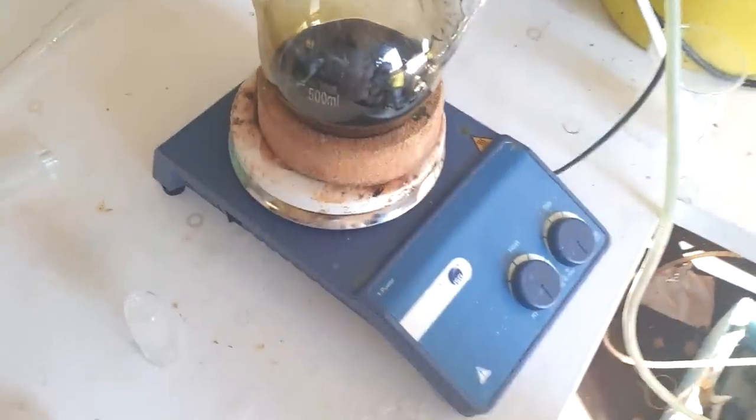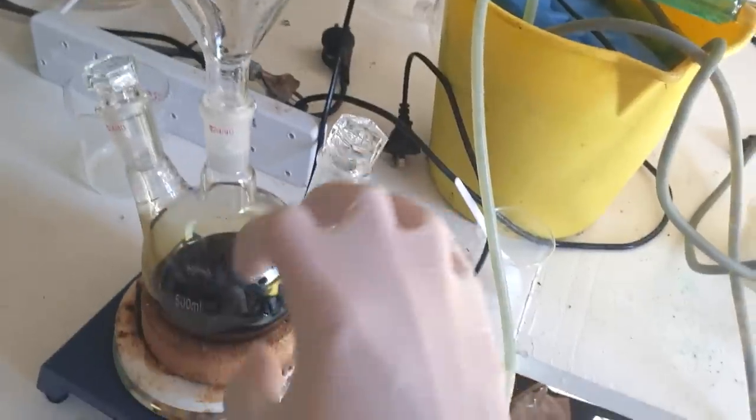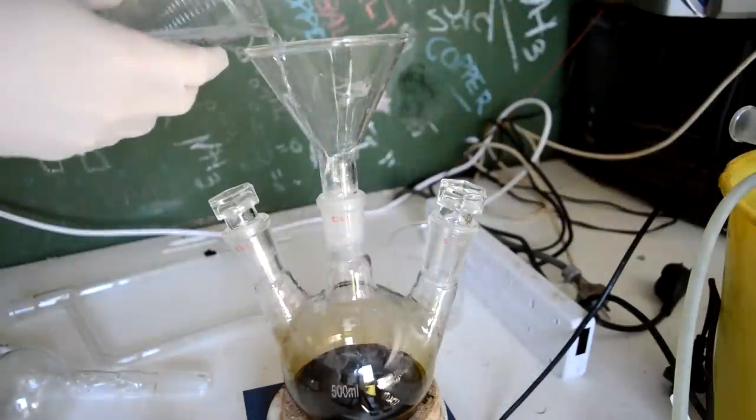We should be expecting that because there's no water in here at all. We've driven all the water out with the Dean Stark. You can see that that solid is down the bottom. It can't really react because it needs the water to react. We assume that all the sulfuric acid has migrated into the toluene as paratoluenesulfonic acid, you know, PTSA or whatever.